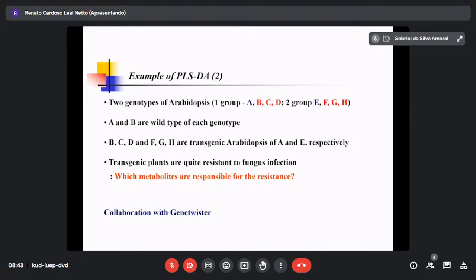One of the typical supervised methods is partial least squares. Principal component analysis is an unsupervised method. As I told you, the unsupervised method is more or less PCA. There are no other options in this case. For the supervised method, the second level, you provide your Y data, depending on this. Every day, a new method comes out statistically.